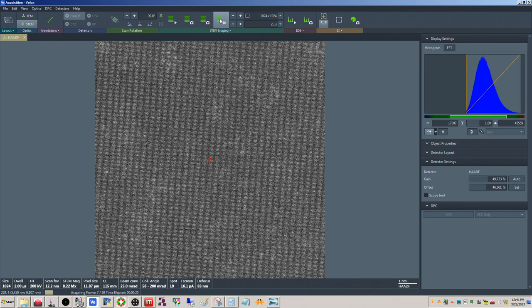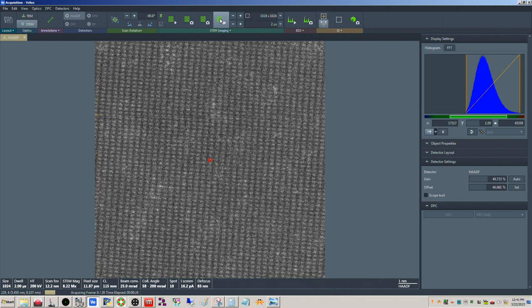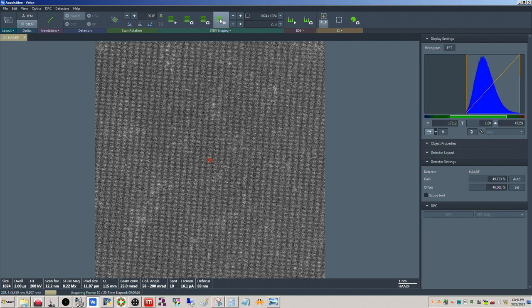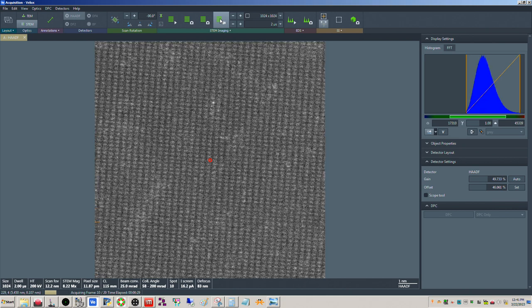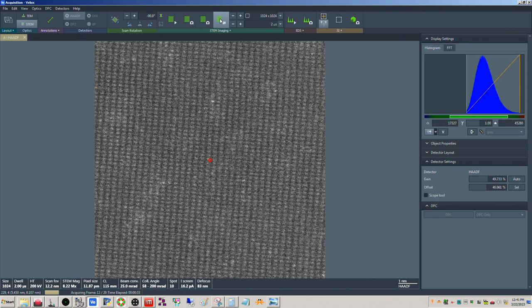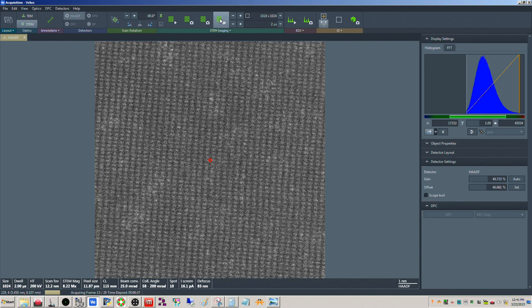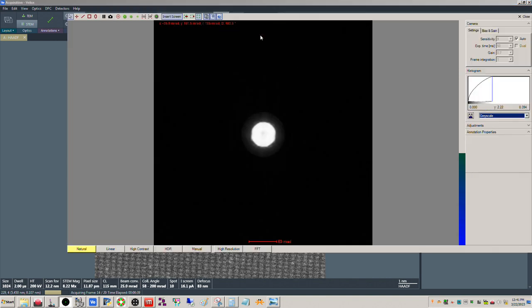So yeah, in the original video, I did a lot of that adjusting through the stigmator panel and the user interface. Most of what you want to do is through S-Core and not through the UI, except for the final fine tuning. Okay, this is still looking pretty good.